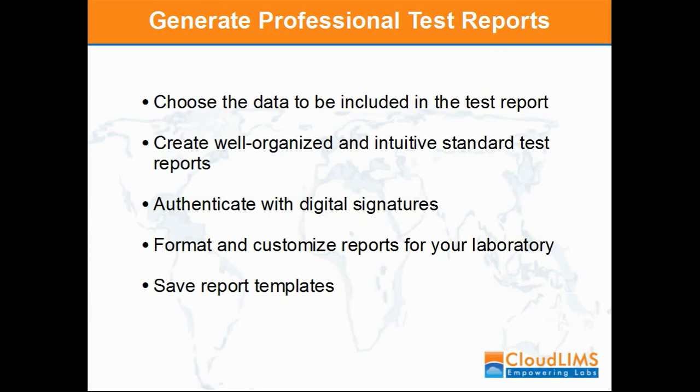A LIMS typically helps reduce manpower cost by offering the ability to create custom and standard test reports that are well organized and intuitive, and which are authenticated with digital signatures. LIMS also provides a provision to include a company logo for report customization.